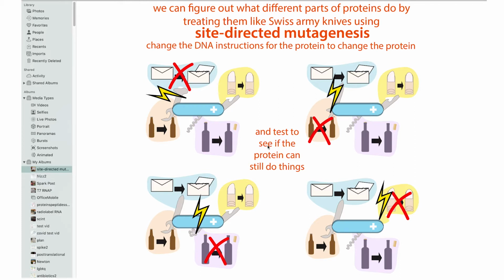You can think about different regions of proteins, which we often call domains. Sometimes we talk about structural domains, which are parts of the protein that will fold on their own, or there can also be functional domains. So sometimes the constructs we have are only certain domains of a protein, or we take away a domain and see if it still does that sort of thing.